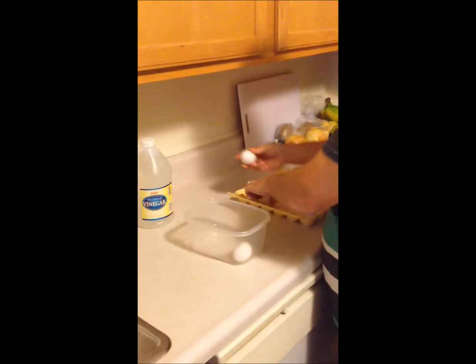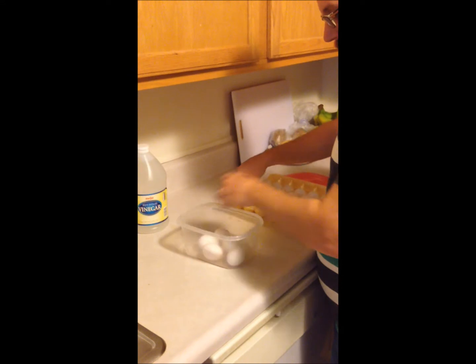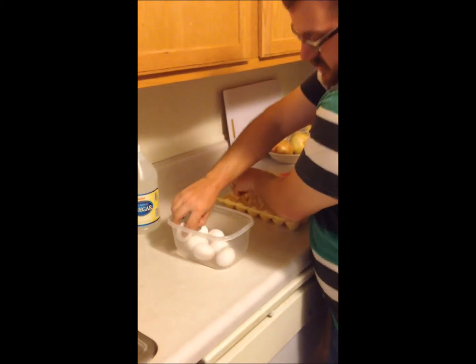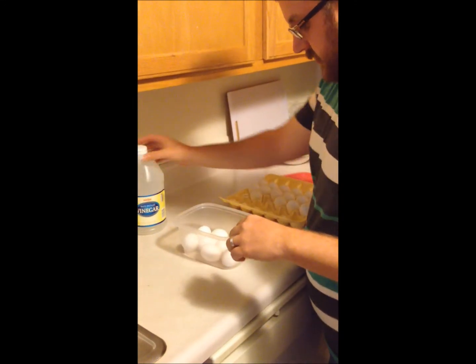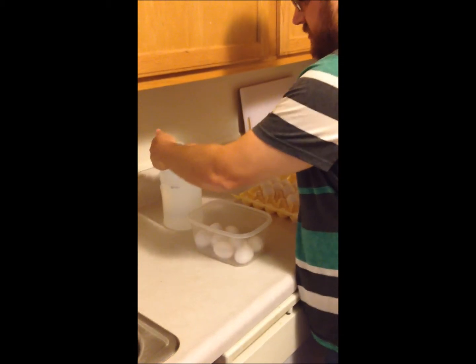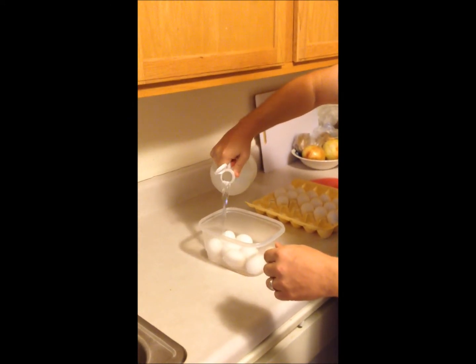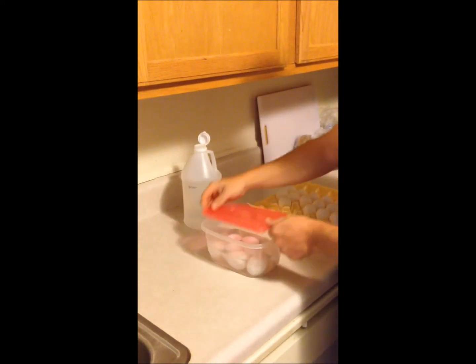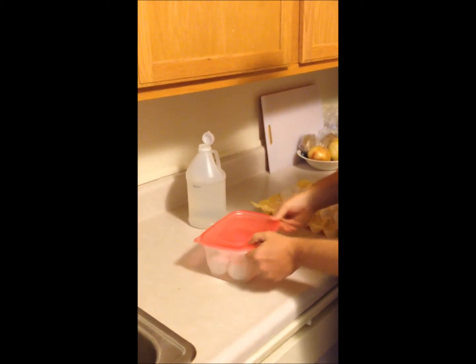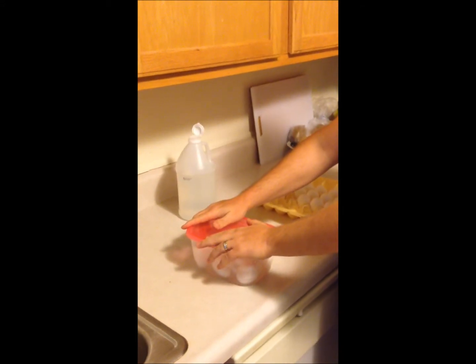So this is what that might look like. The eggs go into the container — leave a little bit of room so they don't get broken. Then just take regular vinegar, pour it in on top, and place the lid.